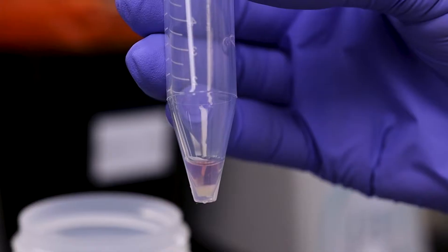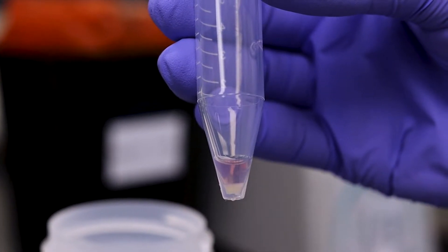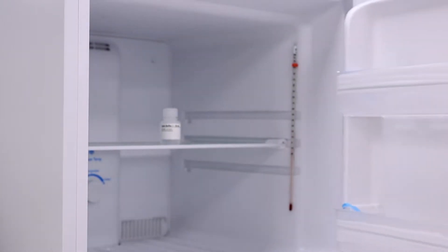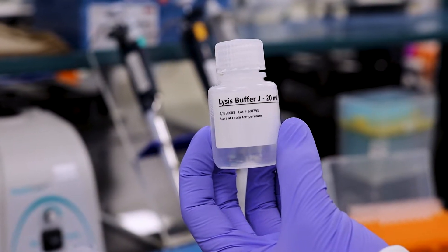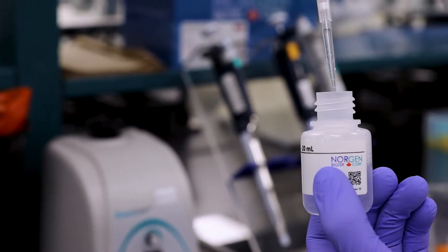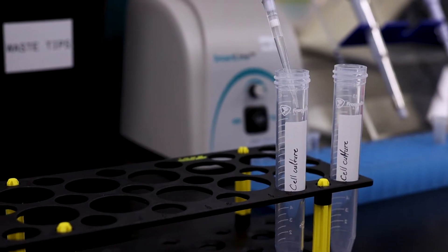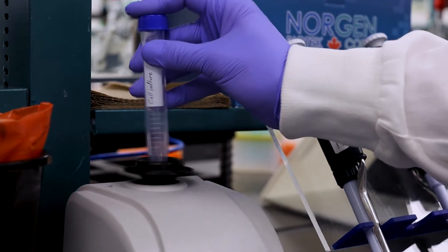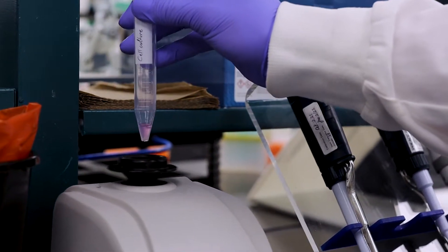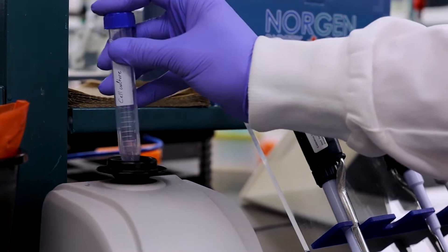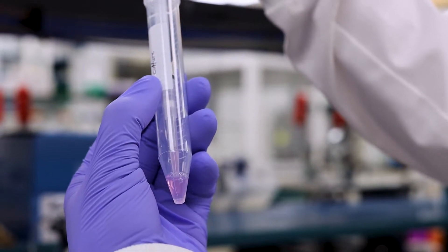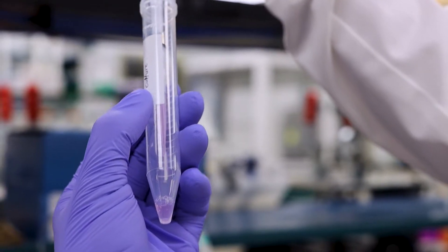A few microliters of media may be left behind with the pellet to ensure it is not dislodged. Add 200 microliters of ice-cold Lysis Buffer J to the pellet. Lyse cells by vortexing for 15 seconds. Ensure that the pellet is completely dissolved before proceeding. Using a pipette, transfer the lysate to an RNase-free microcentrifuge tube.